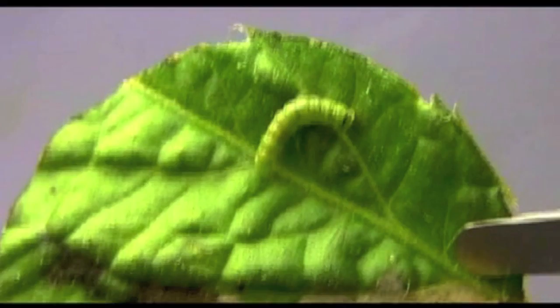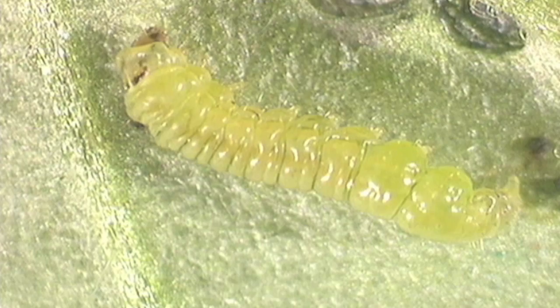Live larvae are normal-looking larvae, like the control larvae, with substantial growth in relation to the original size and usually associated with a significantly mined or damaged leaf disc. Moribund larvae have a lack of coordinated movements when gently stimulated with a needle or forceps. These larvae show symptoms indicating they have been affected by the insecticide and may die soon.